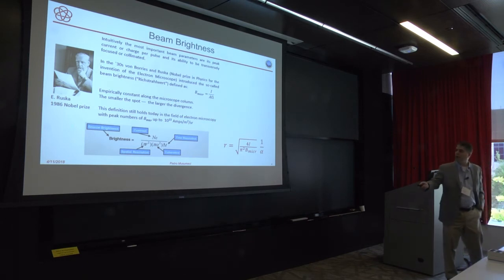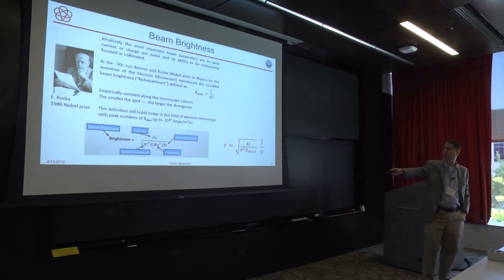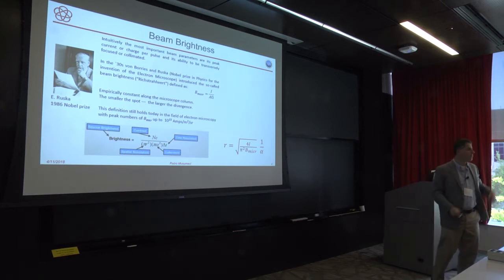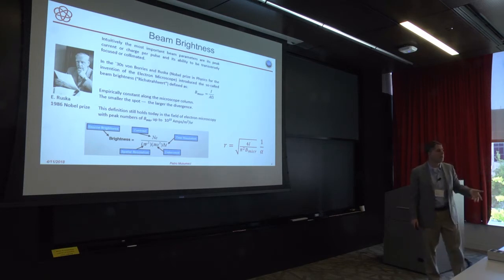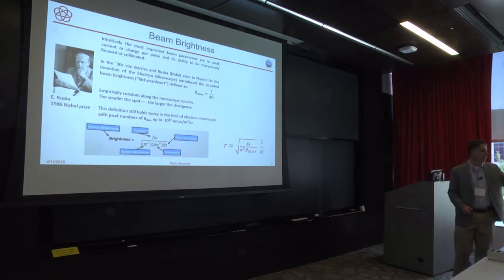If you write down that formula and rearrange it a little bit, there's the beam current, which is going to be the number of electrons in the amount of time that I'm going to be doing things. And so when I'm doing ultrafast, how close I'm trying to squeeze stuff becomes important. The number of electrons is very important for the contrast and the resolution of the image because of Poisson statistics. We're always noise limited. If I have N electrons, my fluctuations are square root of N. So if I only have 100 electrons, I'm going to have 10% noise, and I'm not going to be able to resolve features less than 10% contrast.